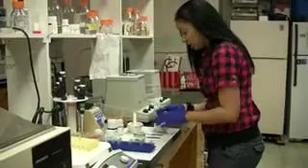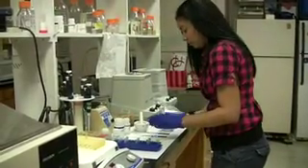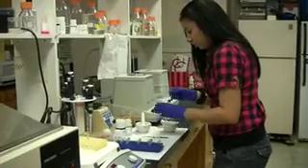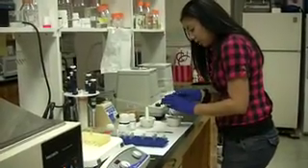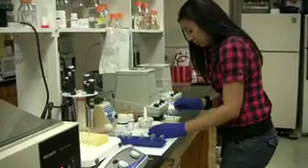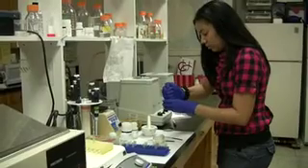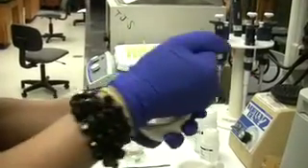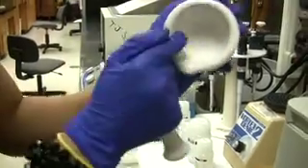We're going to start the extraction now. We're going to put the sample in the mortar. We're going to put a little bit of sand in it to break up the tissue, then we're going to grind it up and continue to break it down until it's like a white pasty look. You can see all the tissue is breaking down.